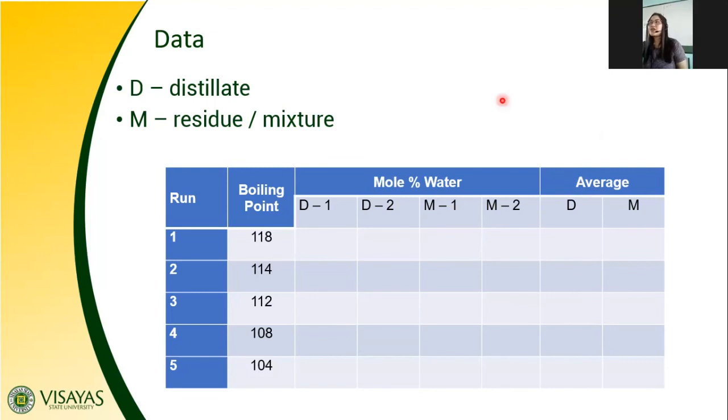For this experiment, we used the simple distillation setup. I don't know whether we will use steam distillation in the next exercise. As for now, we will use the simple distillation setup in the lab for this exercise. So that's it for our exercise number 5.